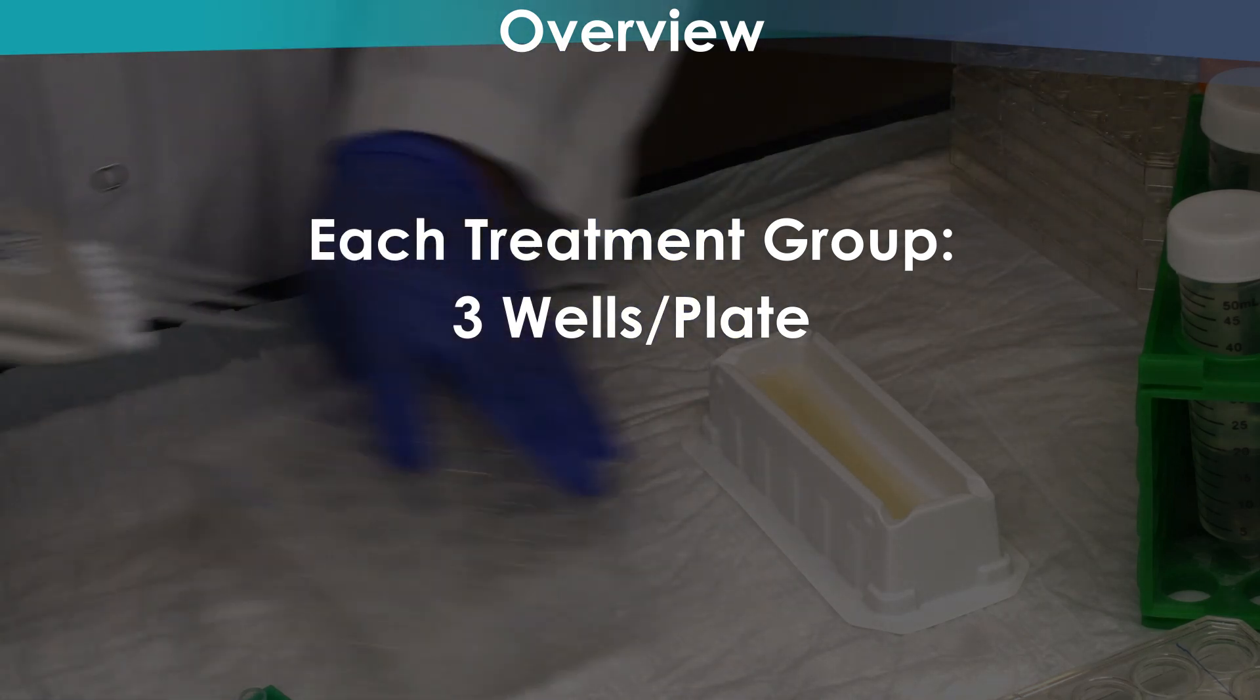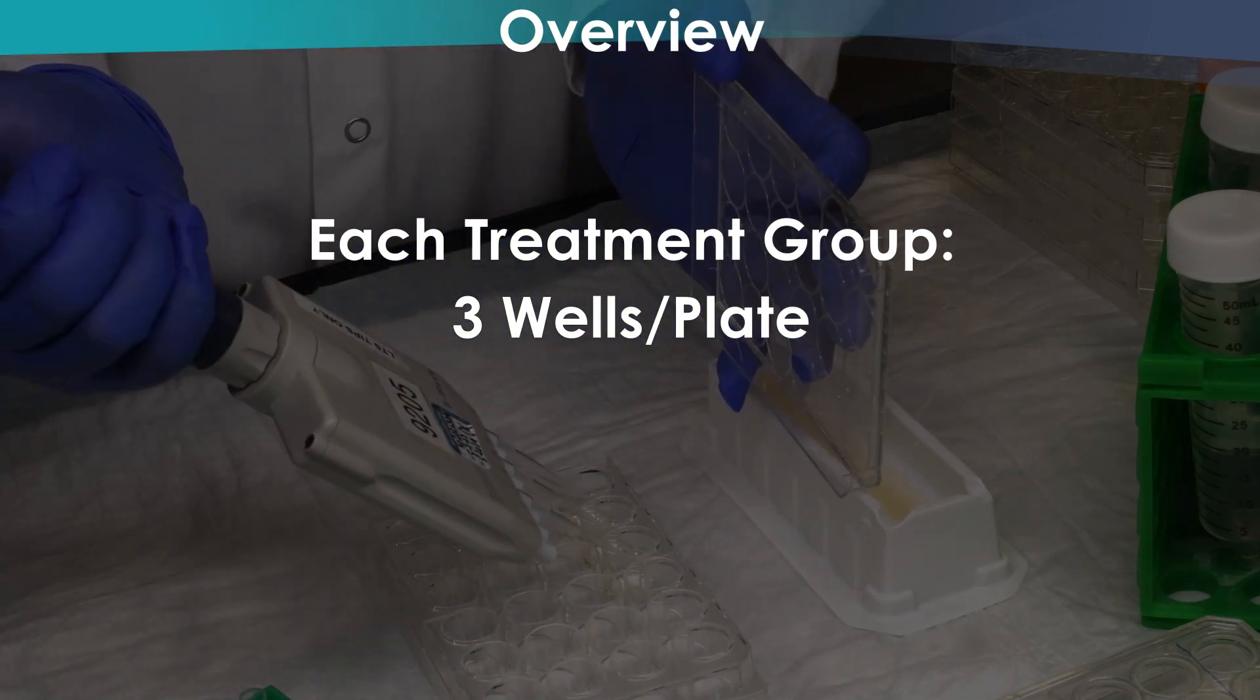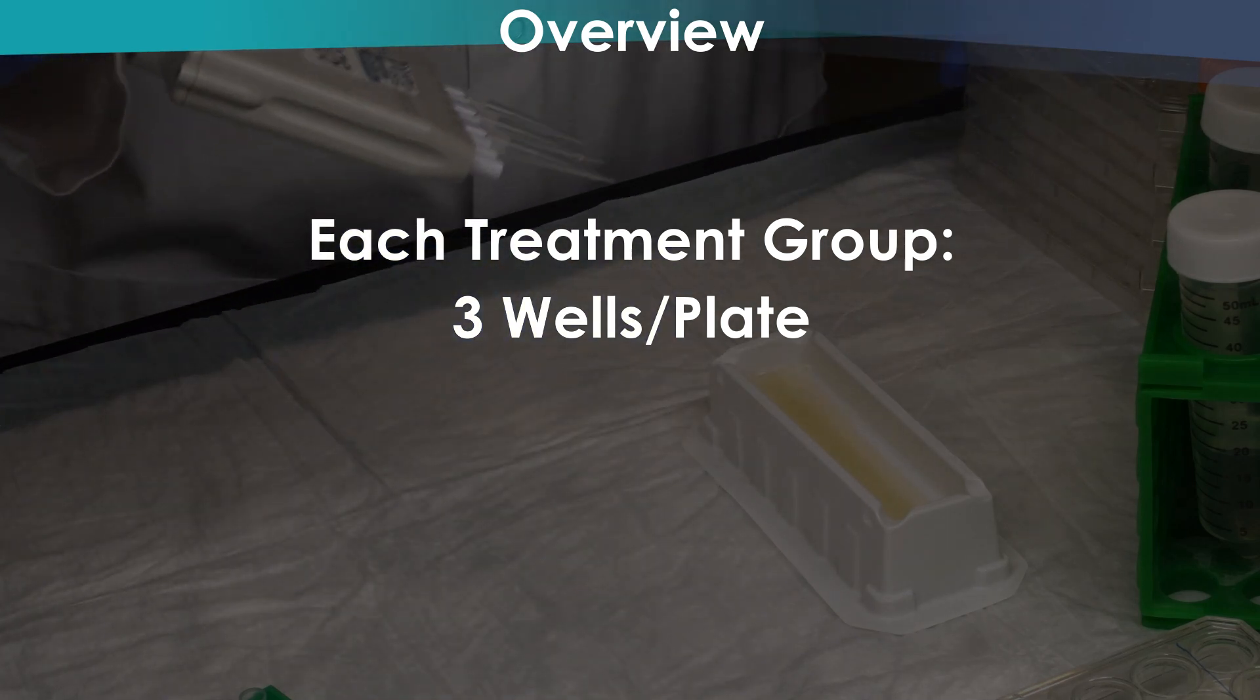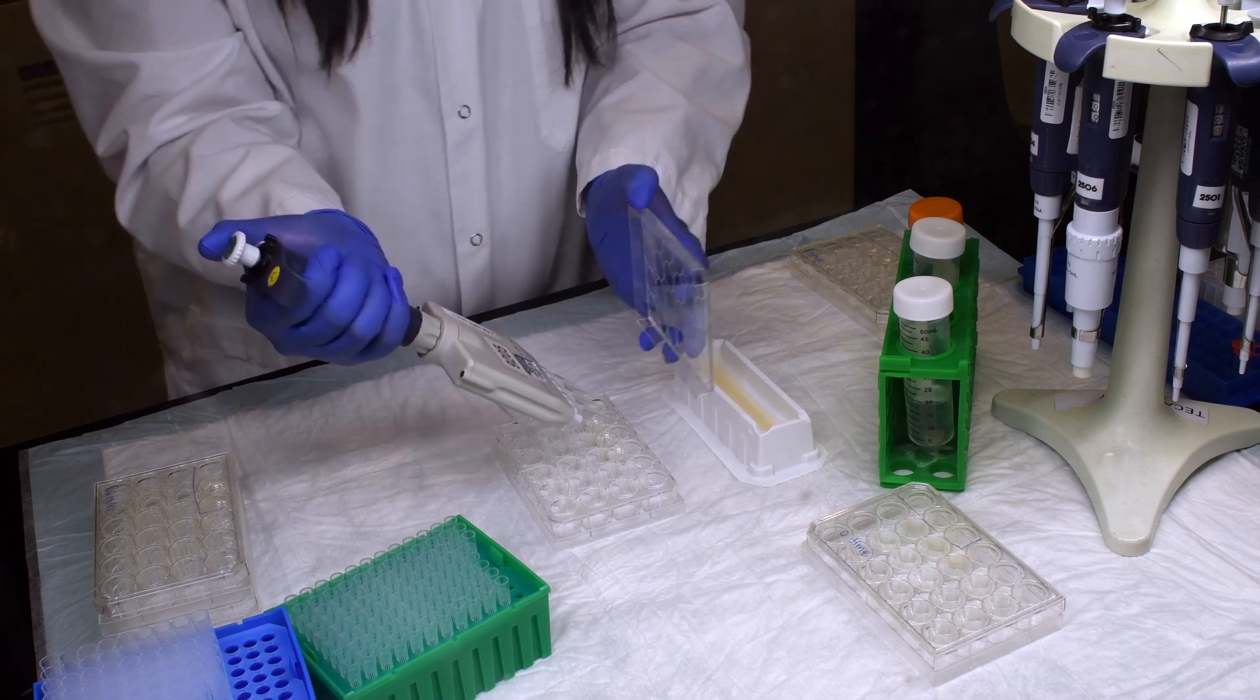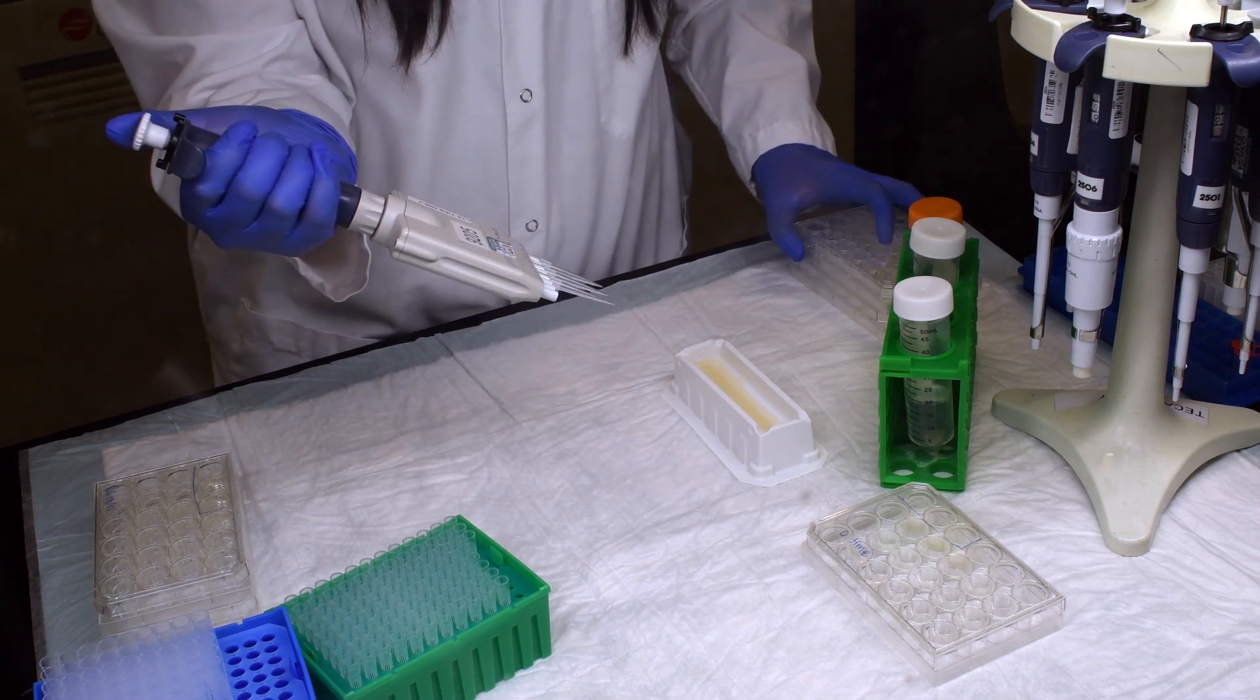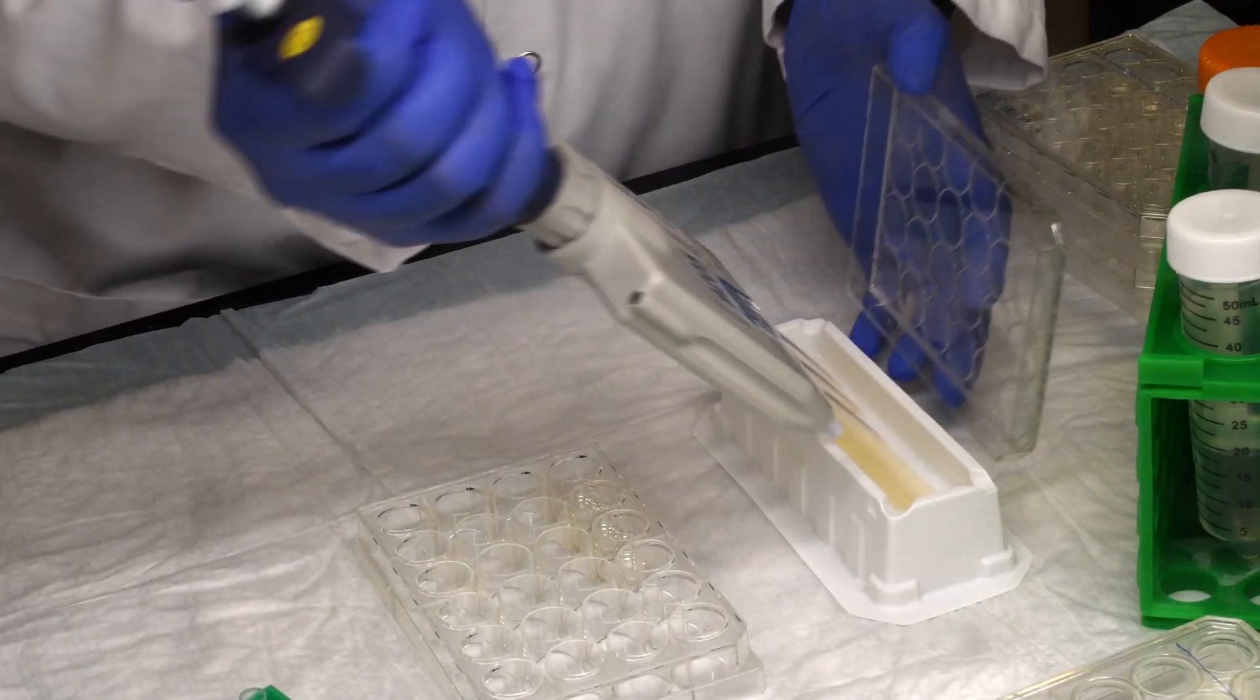We use this experimental design versus one large incubation volume whereupon various time points are taken from the same well or where each time point for each treatment is on the same plate. The advantage of the protocol described today does not expose the incubations to temperature shifts while you collect samples from the large volume, and it minimizes potential experimental variability due to imprecise sampling.